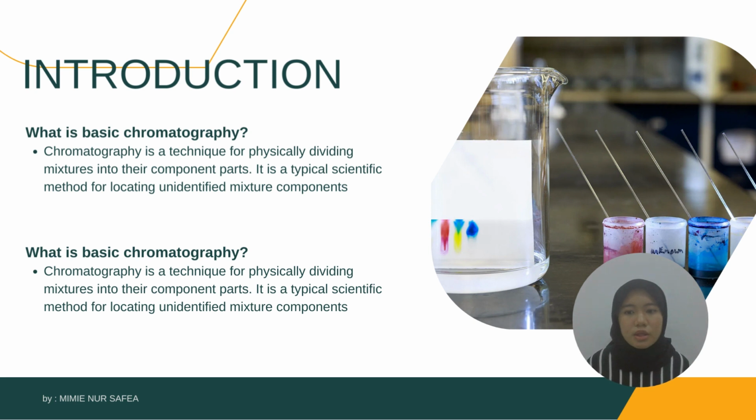It is a cheap technique of doing so. It is an analytical tool that just requires a tiny amount of sample.